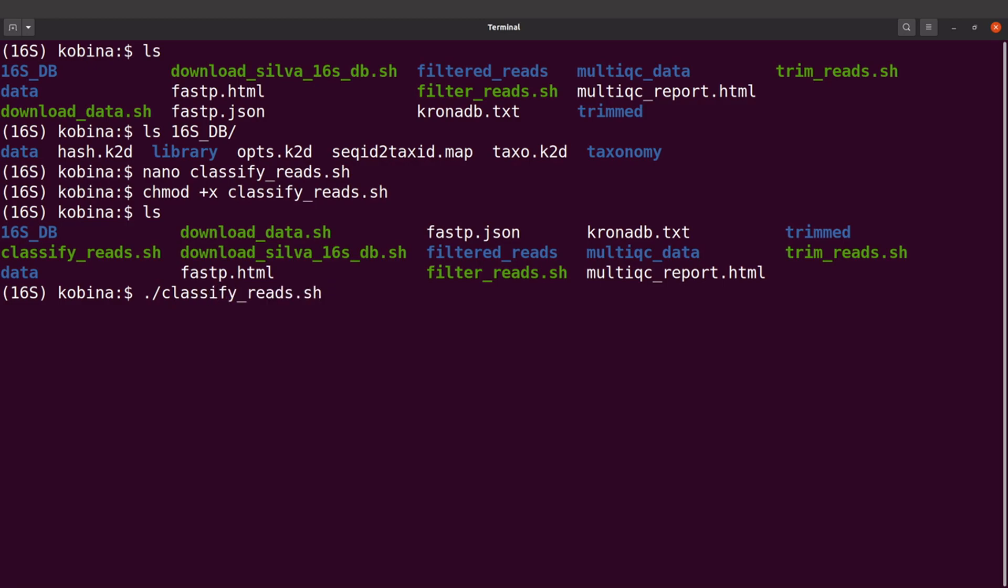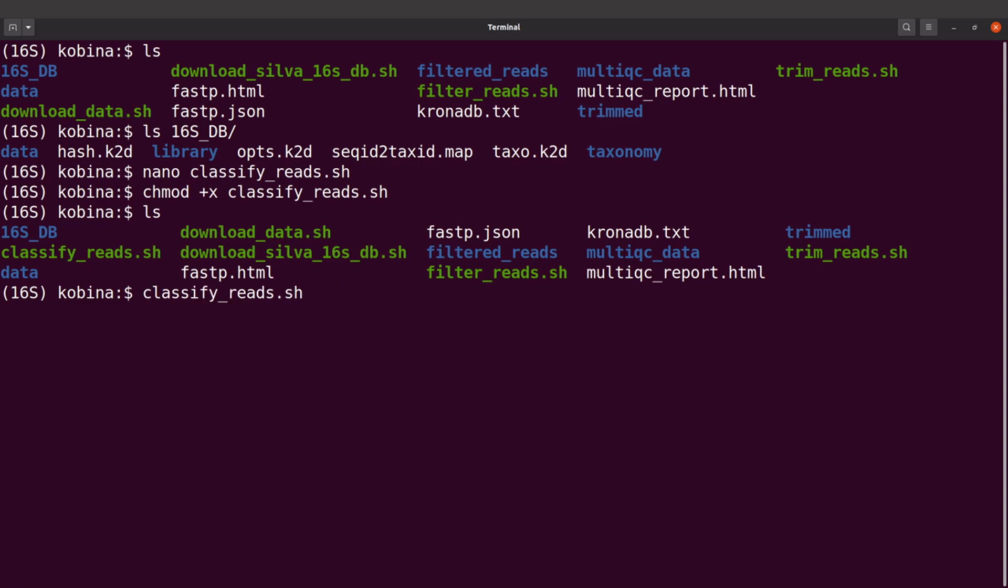I'll say ./classify_reads.sh. Now with the execution, you can do it this way or you can also specify bash and then just specify the script, but I prefer to do it this way. So I'll run this script.